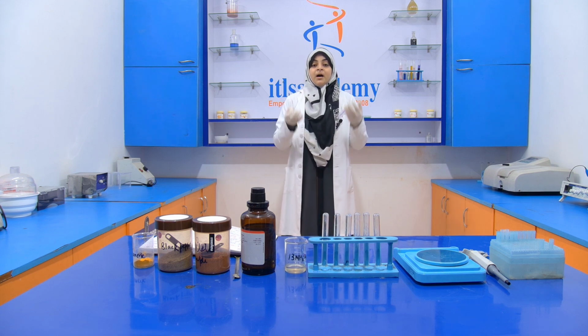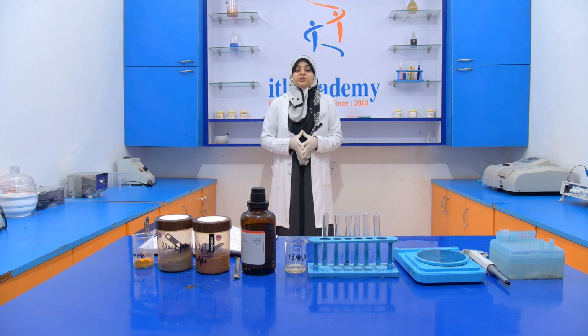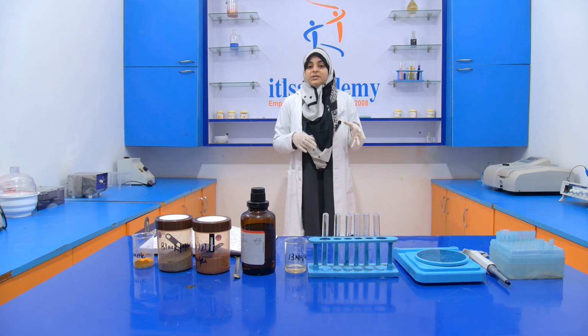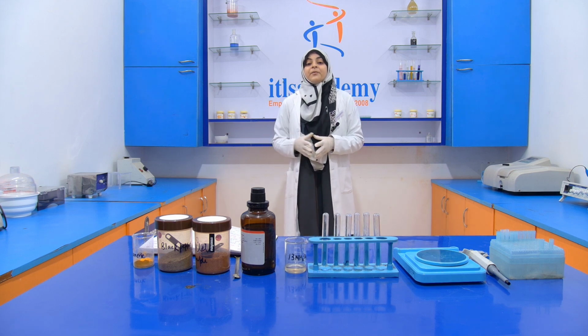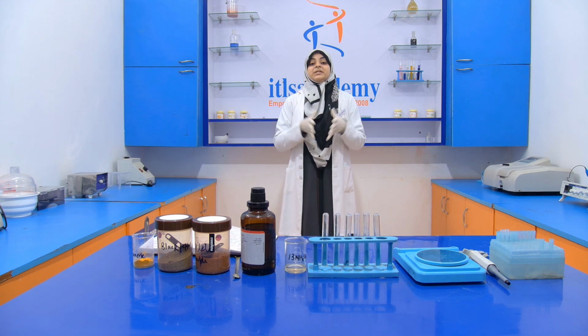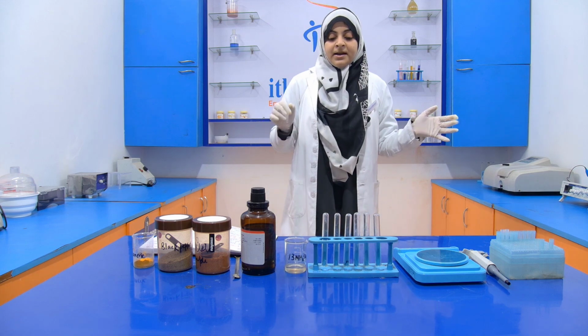If it comes in contact with our eyes, it will damage our eyes and cause irritation. Even if we inhale the vapors of the concentrated acid, it will affect our respiratory tract and sometimes also our digestive tract. So this is about the concentrated acid.